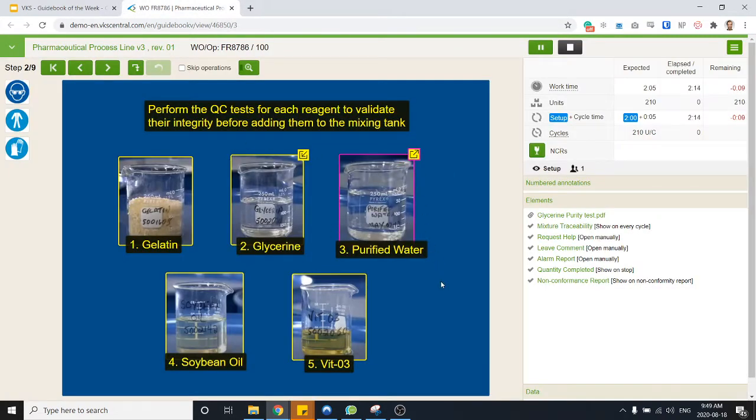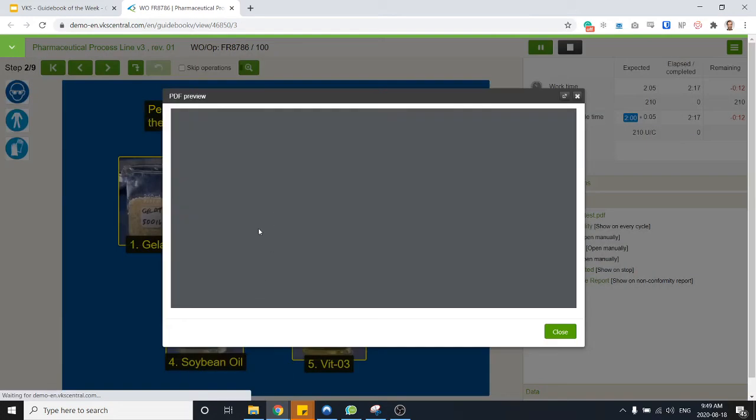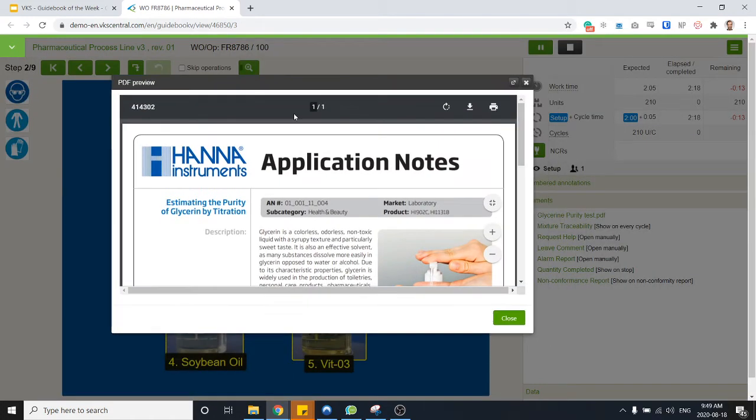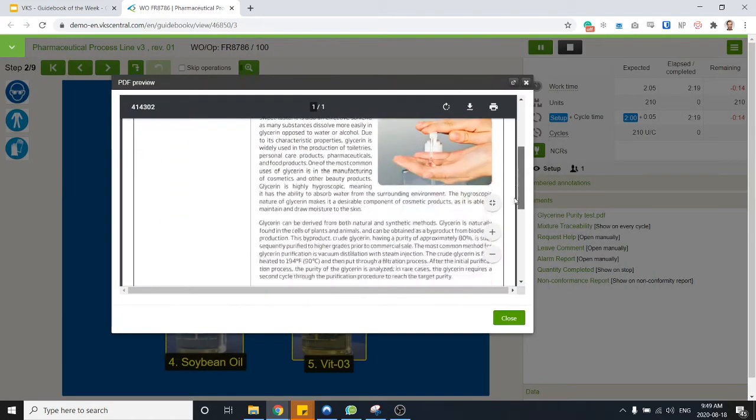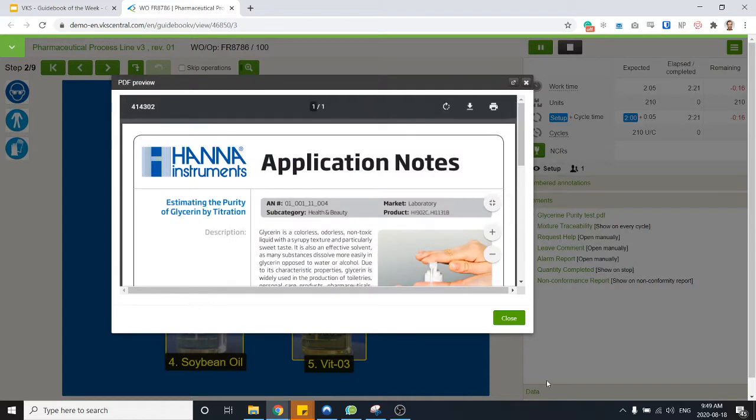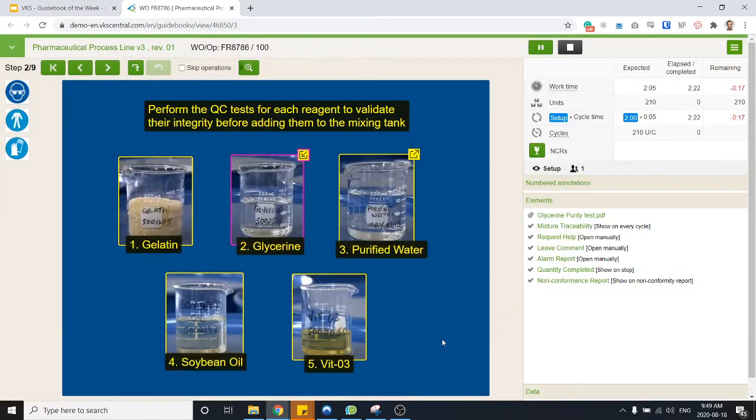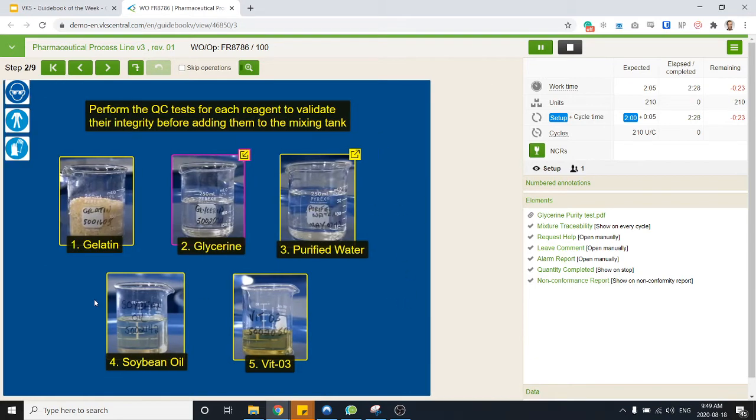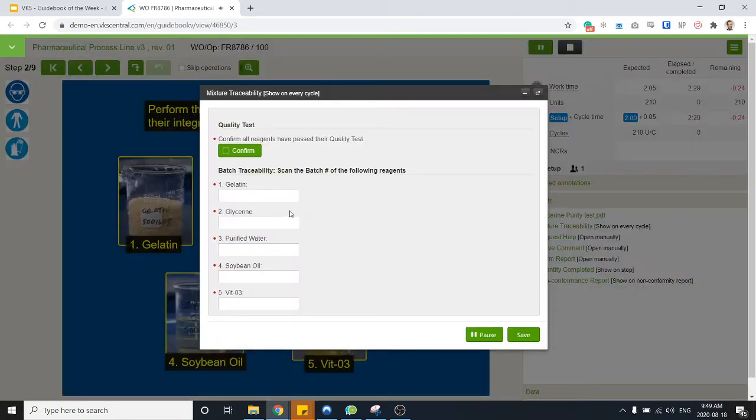Instead of linking to other instructions, what you can do is simply have an attachments open up. So it could be a PDF showing me how to do this step. It could open up even a web page if you want. So once you're done with your tests then we can move on.